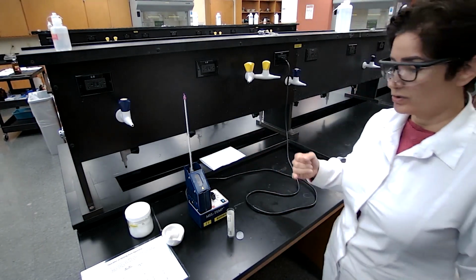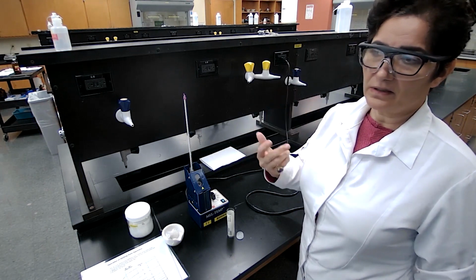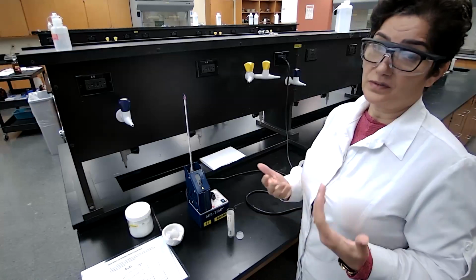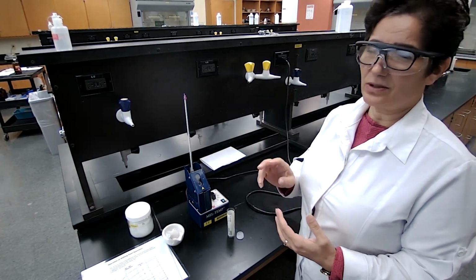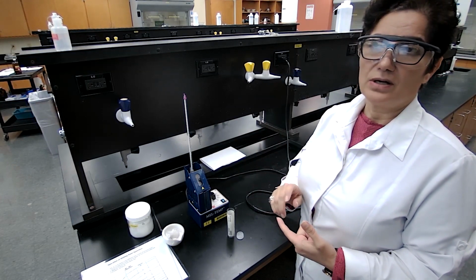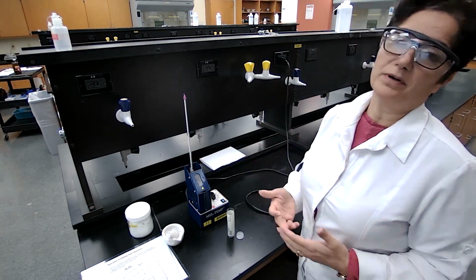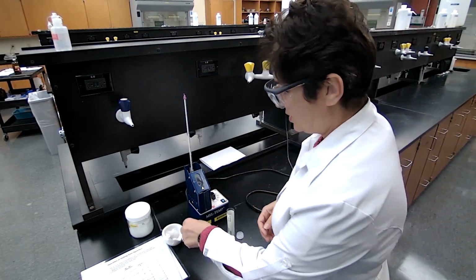We use titration only for carboxylic acid. And if it's other groups, then we prepare a proper derivatized compound. In this experiment, we said that your unknown is going to be either an aldehyde, ketone, alcohol, or carboxylic acid. So we have a limited number of functional groups, so we have specific derivatization.